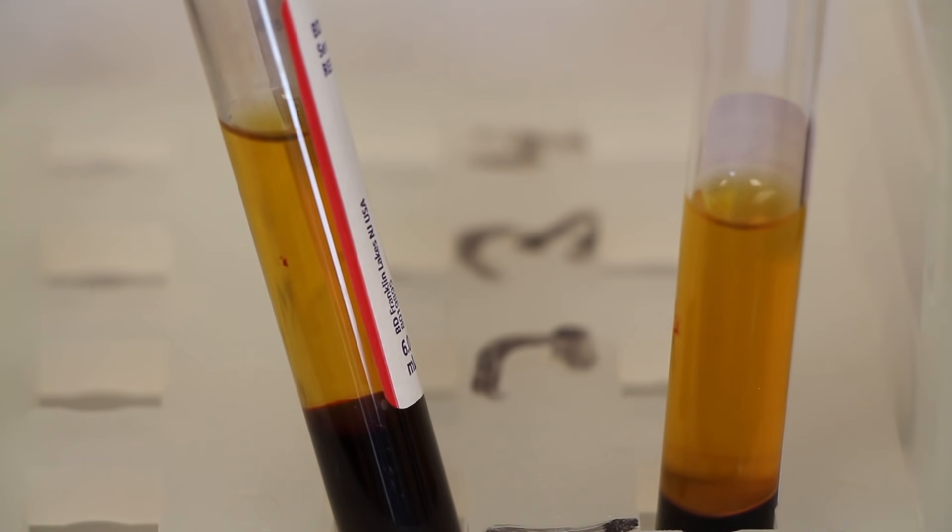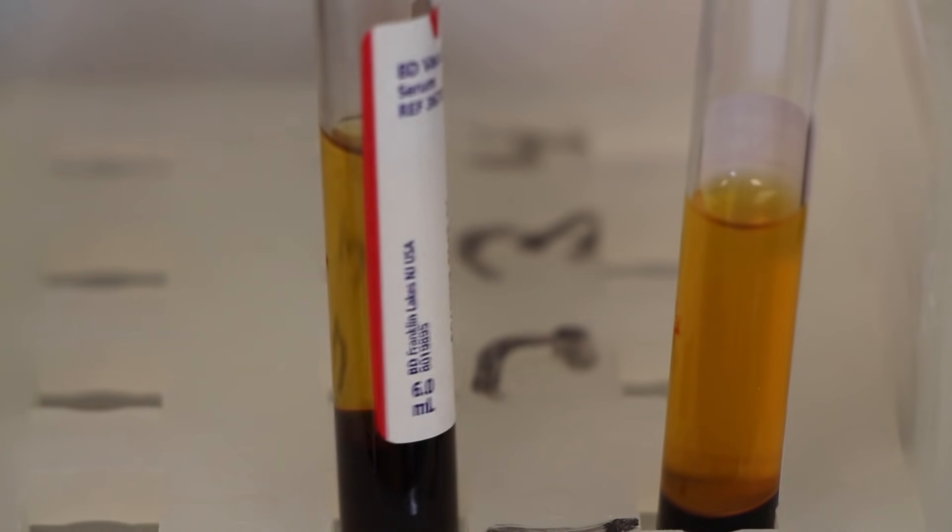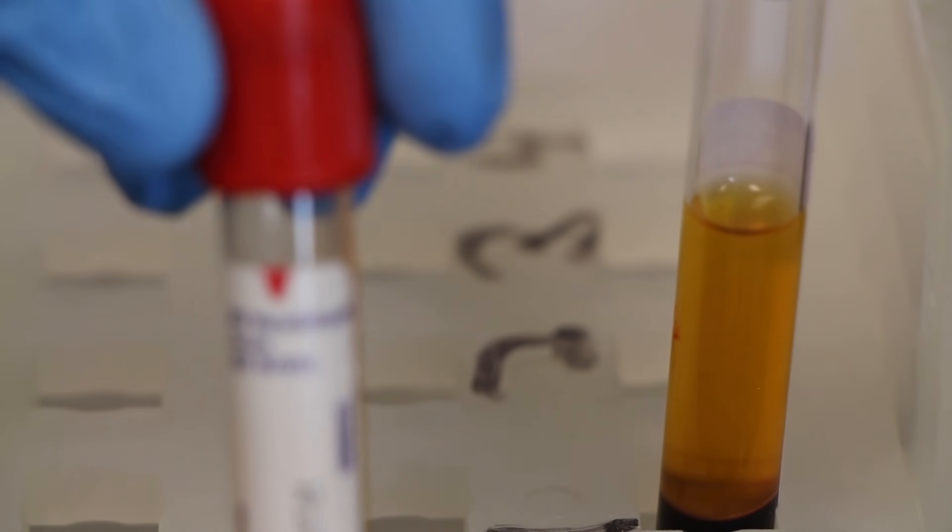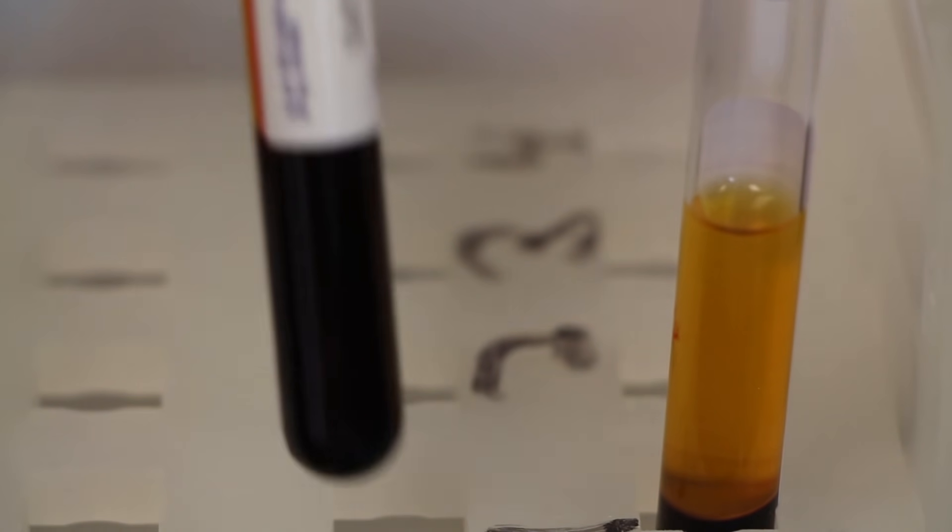If you look at your tubes after they've been centrifuged, there's going to be a clear separation between the blood cells at the bottom and the clear liquid on top. What that clear liquid is depends on the type of tube, whether it was a coagulant or an anticoagulant tube.